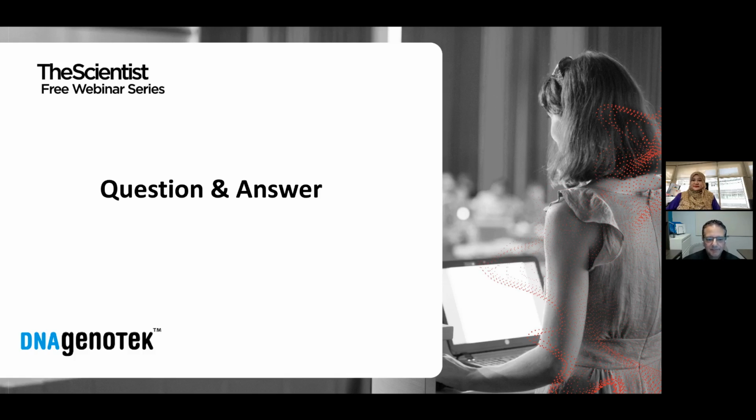Perfect, thank you. I think maybe we'll have time for one more. This audience member says, "Hi, Mike, you mentioned that the buffer in the collection device has a lytic property. Is there any concern with this lysis property when combined with lysis buffer in a DNA extraction kit, such as lysing a sample for too long or exposing a sample that is already lysed to stabilizing buffer?"